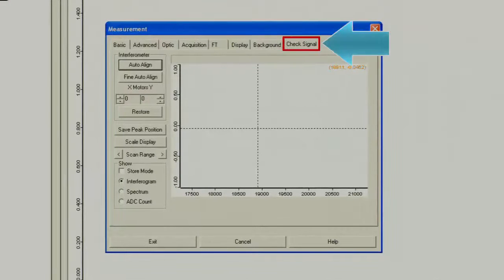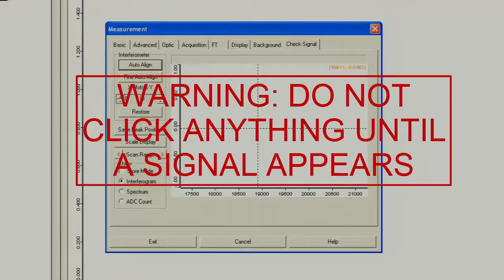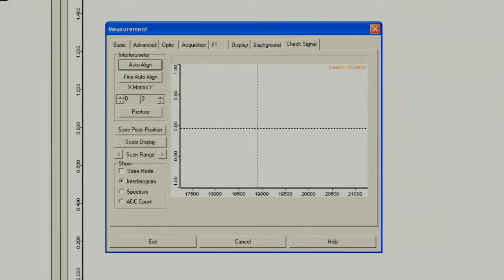Next you want to check the signal, so click check signal. Once you are on the check signal tab, do not touch, click, or press anything until the signal shows up. If you do, the software will likely crash. It may take a little while for the signal to appear, but be patient.